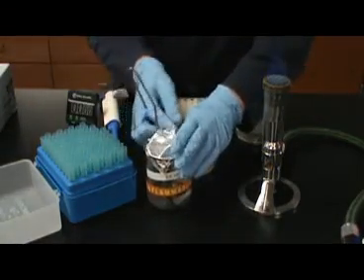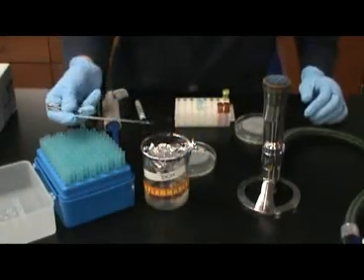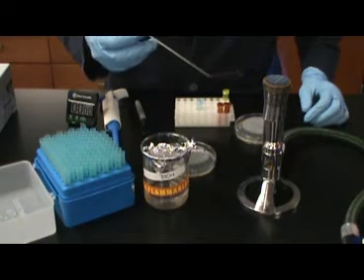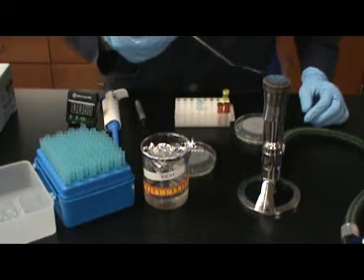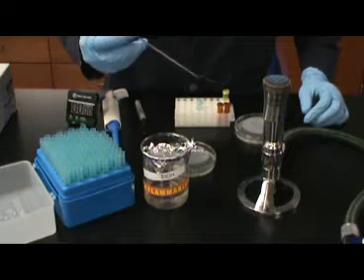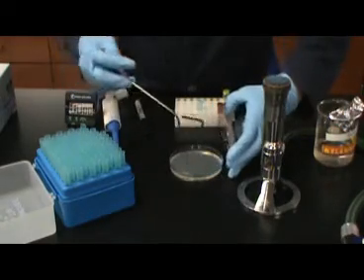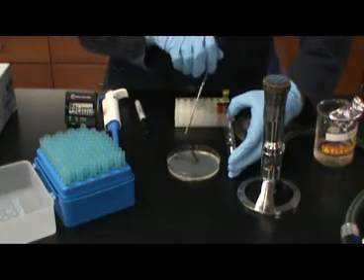Immediately after dispensing the bacteria onto the nutrient agar plate, you will need to spread it using a spreader bar. The spreader bar is dipped in alcohol, then run through the Bunsen burner flame to catch on fire. Once the low blue flame has burned off of the spreader bar, it is ready for use. Do not heat or try to sterilize the spreader bar by allowing it to glow red in the Bunsen burner.